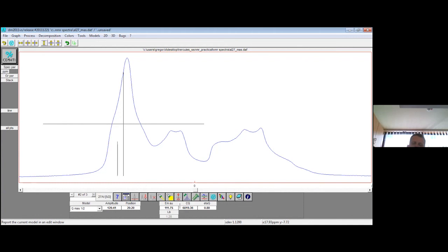So this is all advanced, and of course in these 3 hours we are not able to cover everything. I mean, NMR is quite a versatile, quite capable tool, but it requires some time and some knowledge and some money also. The equipment is not cheap.